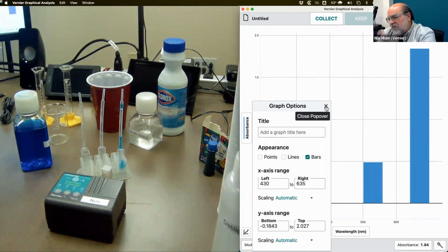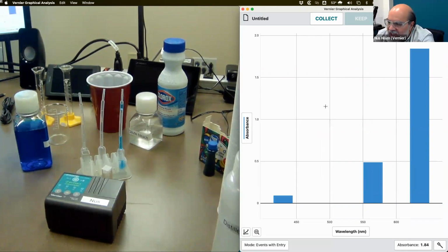So I'm going to give you guys a chance to try stuff on your own later, but it's kind of nice. Hey, there's a bar missing. No, there's not a bar missing. Remember, the absorbance at 470 nanometers was really, really low, and so now it's a discussion of which one of these we should use for the second part of the experiment, and the students found it for themselves. So it's kind of a poor man's spectrum. It's not ideal, but with this device, it's perfect for this experiment.